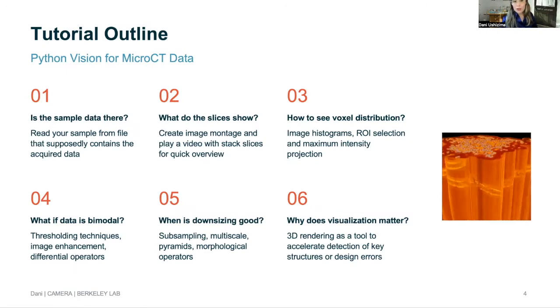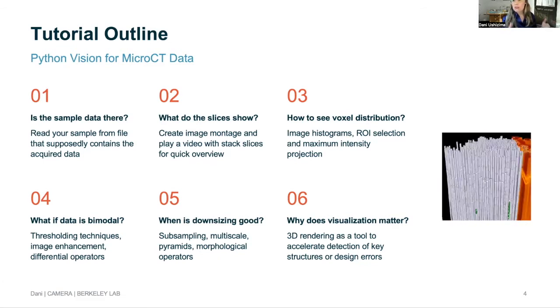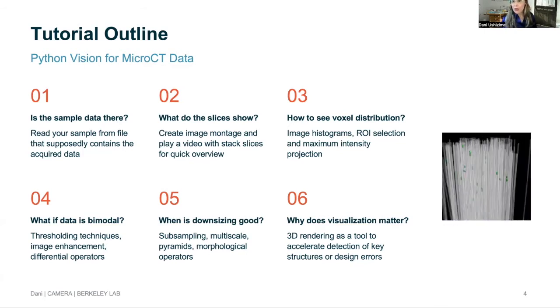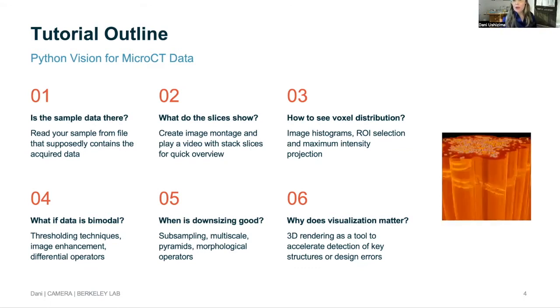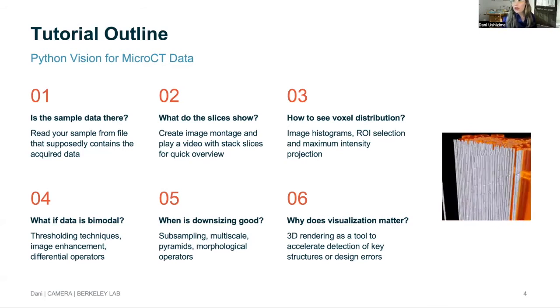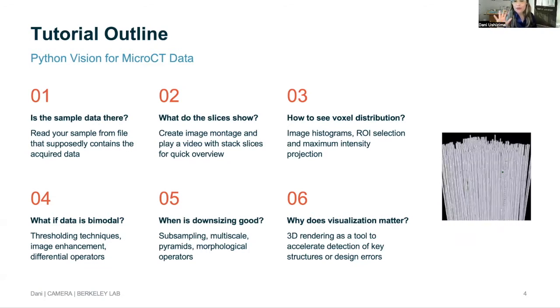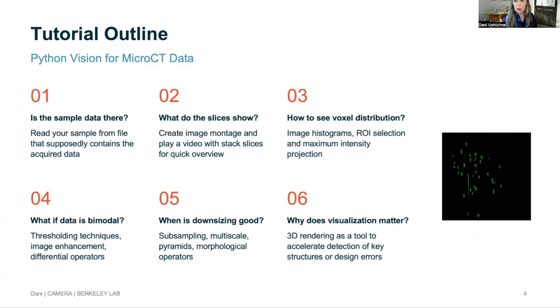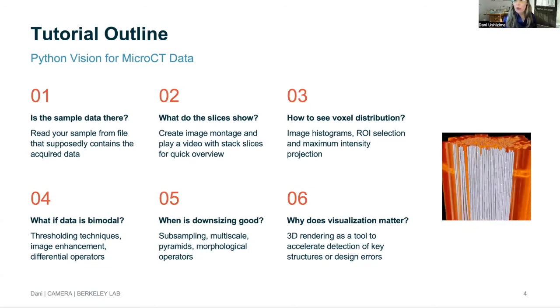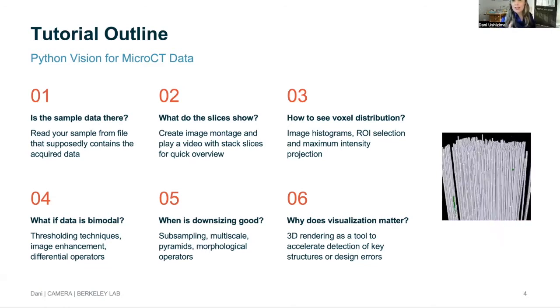What about this tutorial? I divide it into six parts. First, is the sample data there? You just reconstructed — am I seeing what I'm supposed to see? Second, can I actually see all the slices that compose my sample? Third, how to see the voxel distribution? I want to understand the intensities of these voxels. Fourth, if the data is bimodal, are there techniques such as thresholding that I could use? Fifth, how to downsize or downsample your microCT so that you can do a few tests before you deploy the full visualization, which I'm going to teach you on the sixth part of this tutorial.